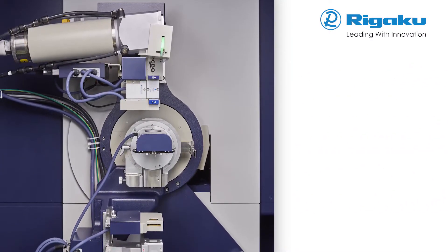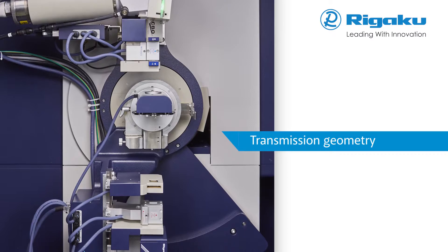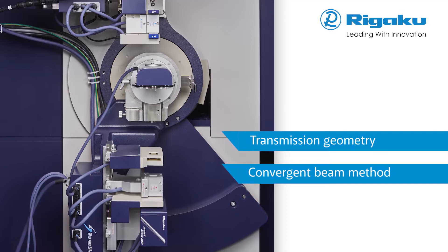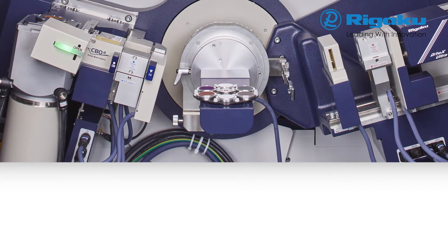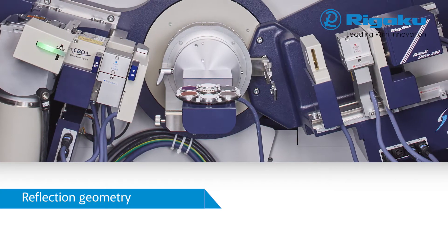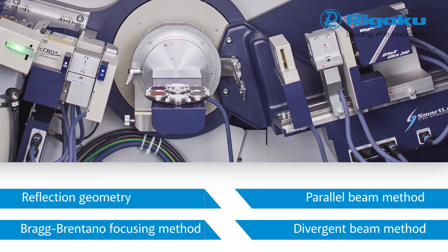X-ray powder diffraction identifies crystallographic phases in a sample and quantifies them. Transmission geometry is known to cancel preferred orientation of a powder sample, and is employed with the convergent beam and parallel beam methods. SmartLab SE supports both reflection and transmission geometries with high sensitivity, thanks to advanced detector technologies. Reflection geometries are employed with the Bragg-Brentano focusing method, as well as the parallel beam and divergent beam methods.